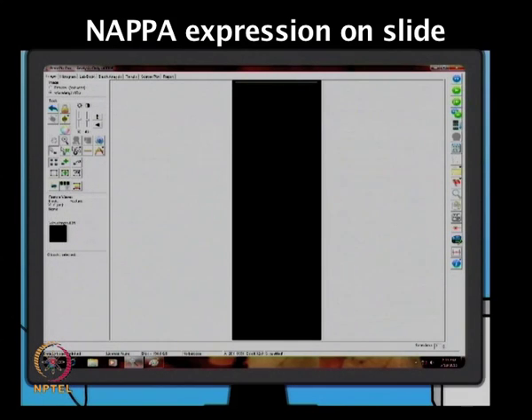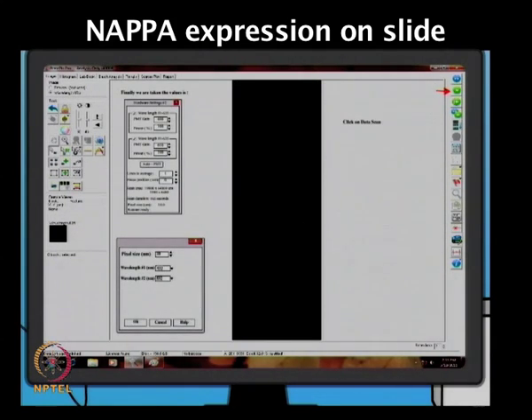First, you can preview the scan, and then you can adjust different settings to see the signals better. Then you can look at each region in the zoomed in view and look for the signal.